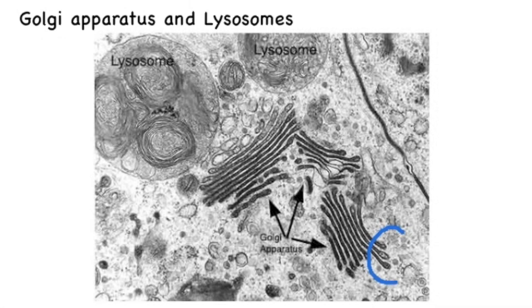Here we are able to identify the Golgi apparatus by its curved shape and by the vesicles, circled in blue, at the end of the tubules. We can also identify the lysosomes, circled in red, and relatively these are a little larger than the Golgi apparatus.